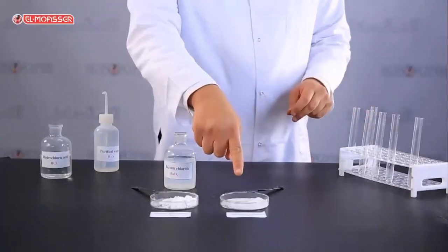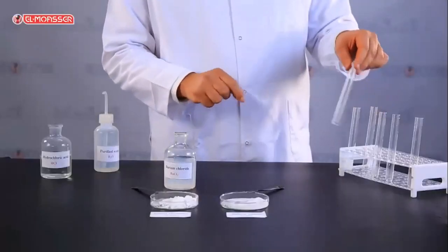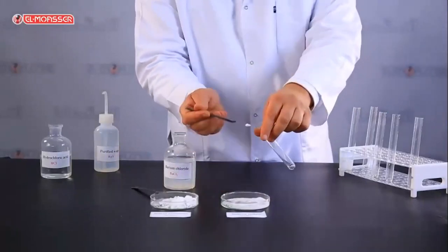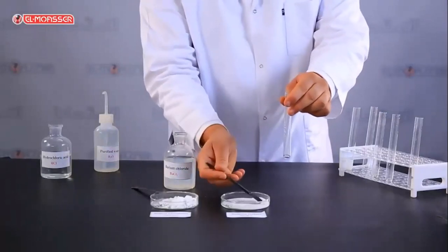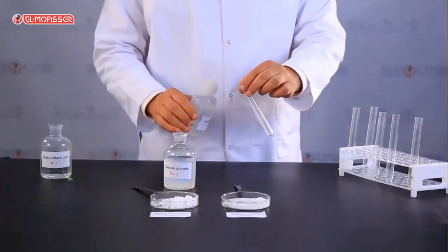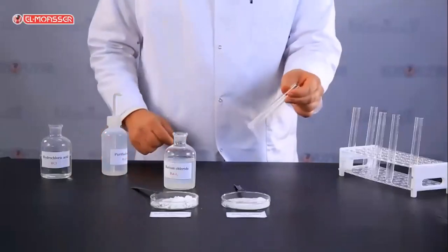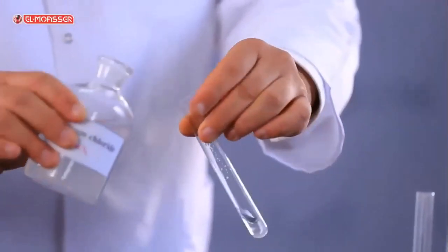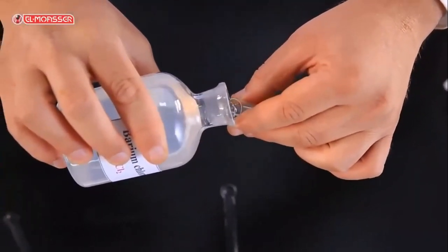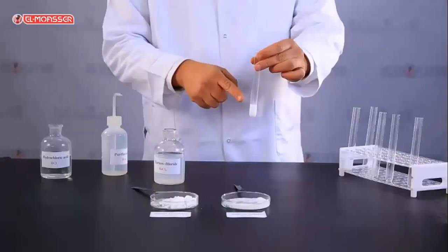The main experiment to detect sulfate anion. Sulfate anion will be detected by using sodium sulfate salt. Transfer a small amount of sodium sulfate salt in a clean test tube. Then add distilled water with shaking to form a solution. Add barium chloride solution. What do you observe? A white precipitate of barium sulfate is formed.